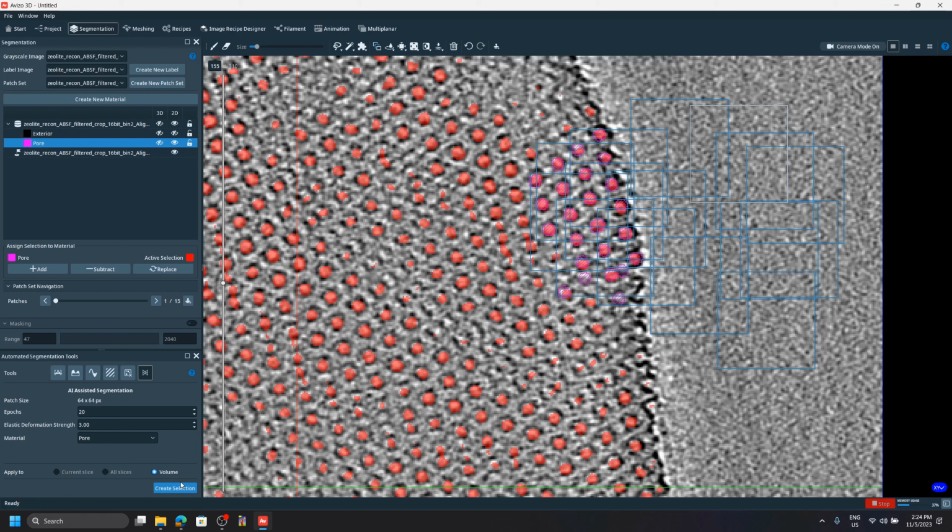With this particular example, because the data is quite homogeneous, the regions with the pores are all the same, and the region with the background is all the same. I only took two regions. There's a tricky region, which is the boundary, so I also tried to take examples there. But the more you use this, the more experience you're going to gain.